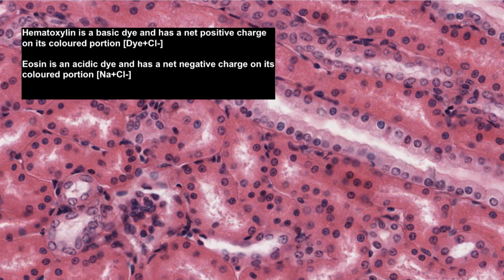Let's now look at the basis of hematoxylin and eosin staining, which we often abbreviate and just say H&E. First, just an important request please. Do not worry about being able to identify all the tissue components I will show you in the images that follow, even though I will probably mention what they are. I am using them only to illustrate different histological stains and what specific components in the tissues they stain. You'll have plenty of opportunity to study these structures where appropriate in this histology course syllabus.